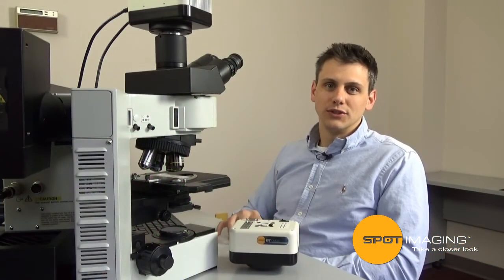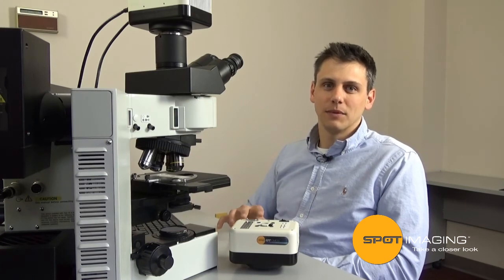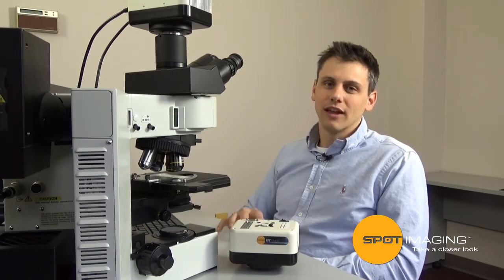Now it's time for you to join us and experience the new wave of cooled SCMOS cameras. It'll have you playing with the big boys at an affordable price. Contact us for more information on how to get your Spot RTS CMOS camera.